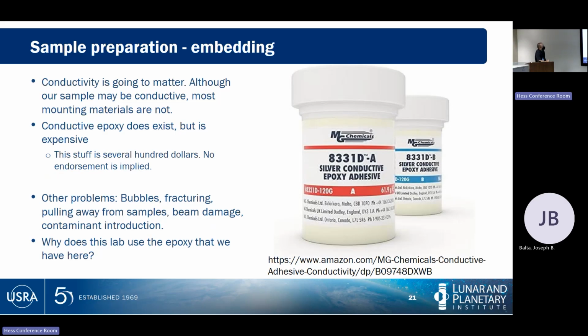This stuff, when I Googled it on Amazon, was several $100s for that single bottle. So I would not suggest spending that unless you know you need it for something. There are some things you do worry about in epoxy. You can crack epoxies. You can get bubbles trapped in there. You can have bubbles that get trapped between the material and your sample.